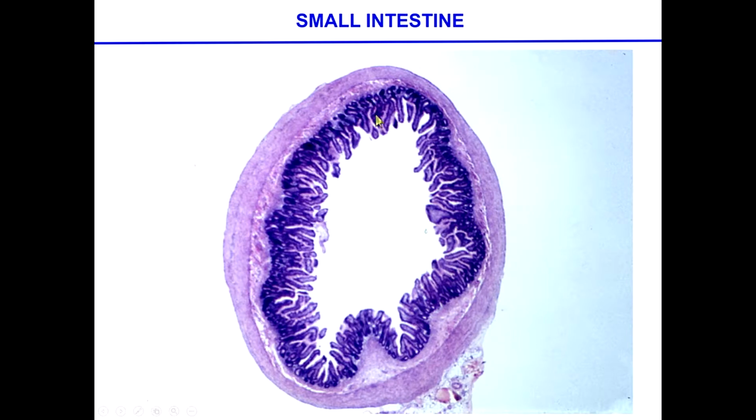You can see all these structures which are formed by epithelial cells. This is pretty much where all the absorption and the metabolism of the nutrients that come this way are located. There is a layer now of the smooth muscle cells, and these are going to be making peristaltic movements as the food comes along to force it going in the proper direction. And then there is a membrane that covers parts of it. We'll look at that when we study the GI.